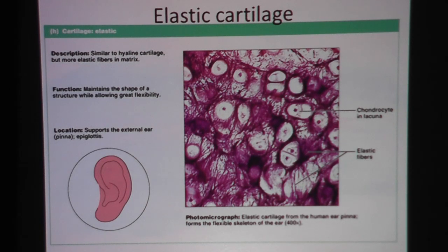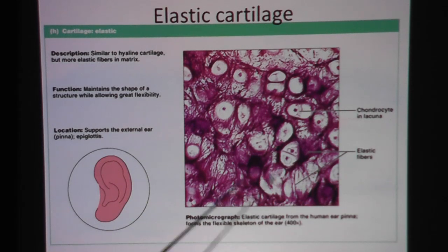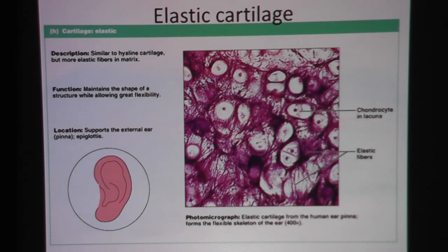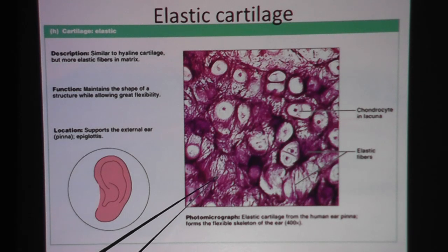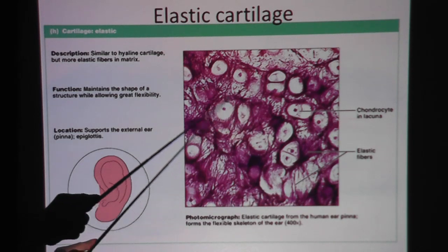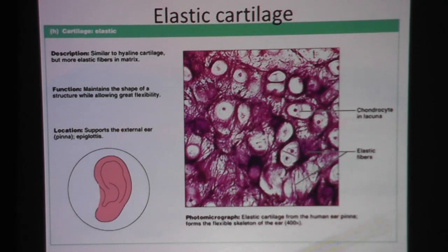We call this elastic cartilage because it has elastic fibers. You may be wondering what elastic fiber looks like. Look back in the areolar or loose connective tissue slide. The elastic fibers tend to be thin and dark. Here you see these little fine thin lines running through the matrix. Notice they tend to be short and random — they don't really have one definite direction.